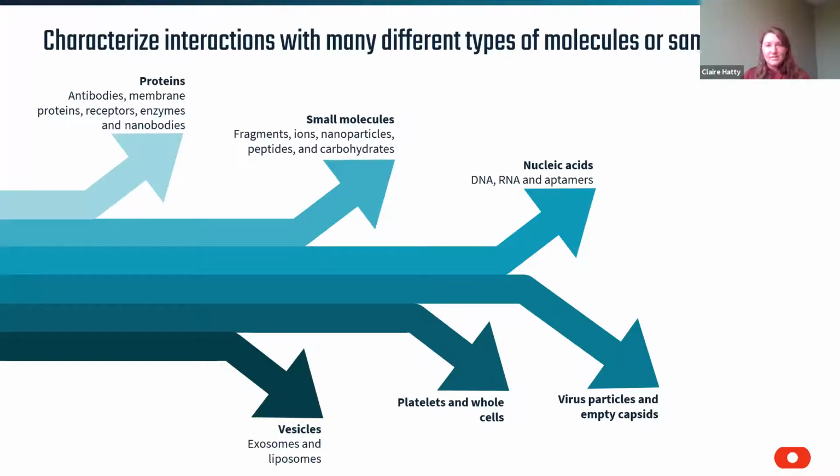With nucleic acids, so DNAs, RNAs, or aptamers. We can look at virus particles and empty capsids. We can look at platelets and whole cells in some setups, and at vesicles like exosomes and liposomes. So we can address a wide range of different biomolecular interactions.